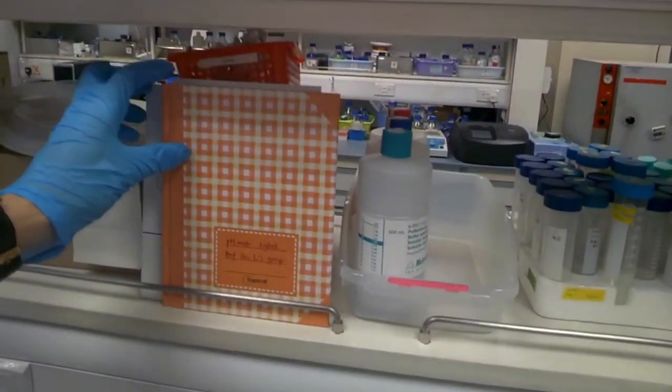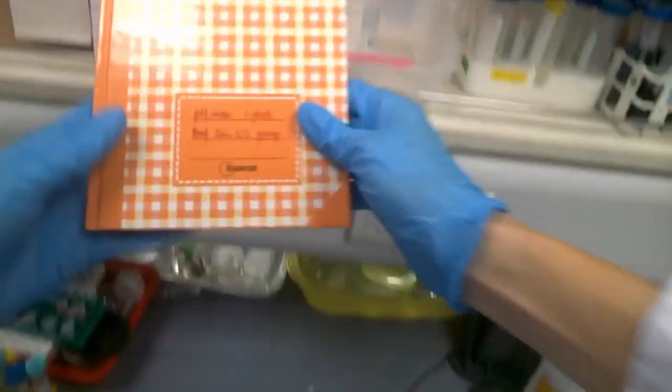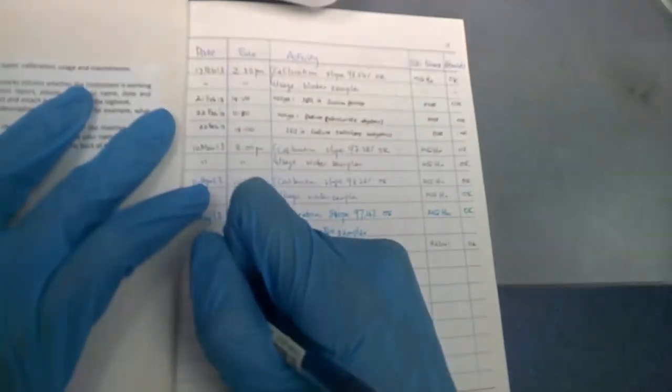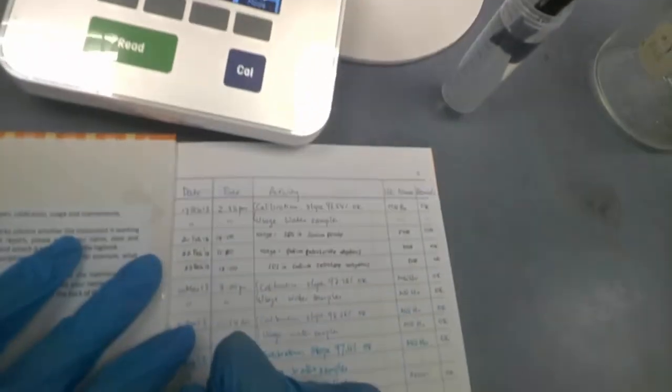After performing any usage of this instrument, you always have to record on this logbook here. Just placed right above this orange logbook, pH meter. Open it. Read instructions. Activity column. Please. Calibration. Usage. Maintenance. So in this case, I did a calibration and demonstration.